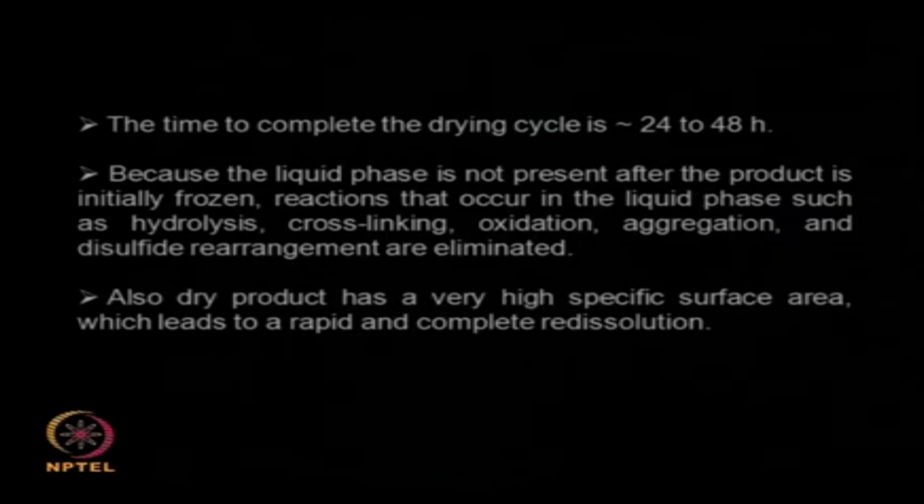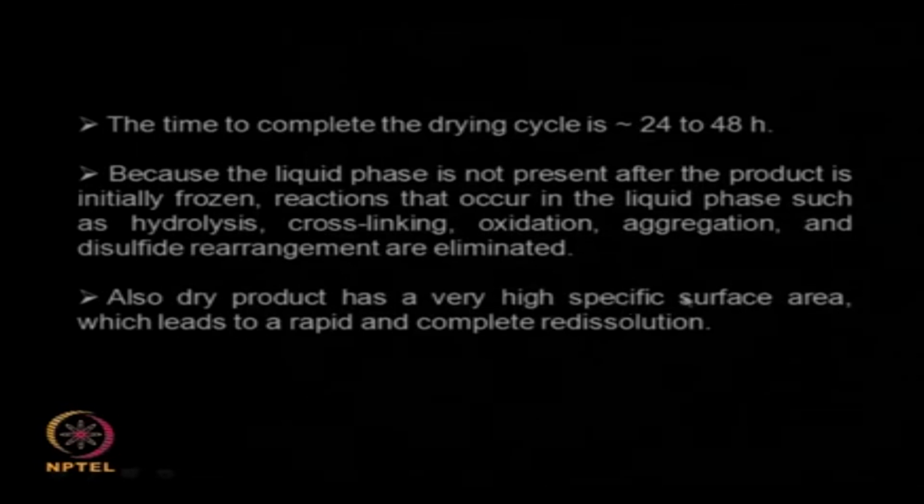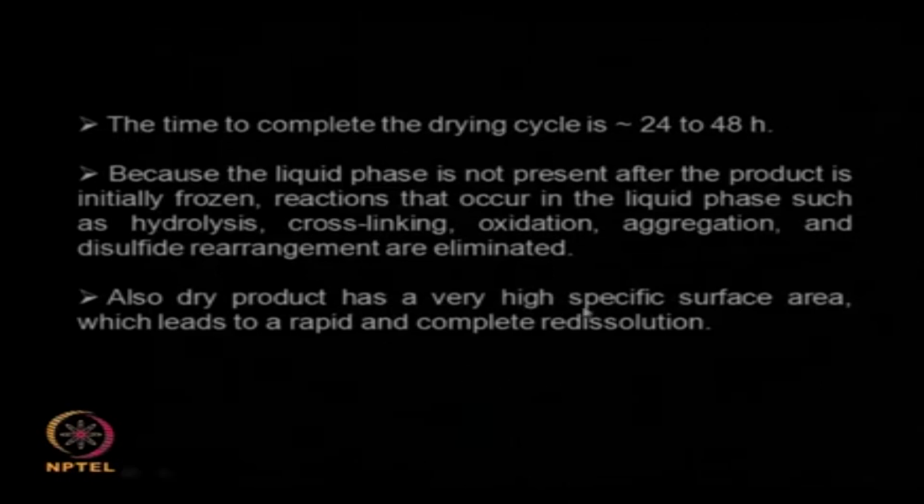Once you do this sort of lyophilization, there is no water present, there is no liquid phase. So reactions like hydrolysis, cross-linking reactions, oxidation reactions, aggregation of the solid material, disulfide rearrangement, all these are prevented. And also when you dry the product completely, it has much higher surface area per volume. So if you want to redissolve it into some solvent, then it is very rapid and complete. So that is the advantage of a lyophilized product.